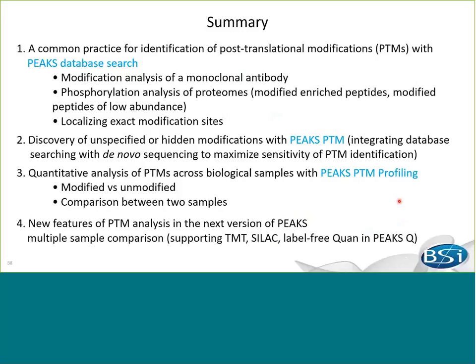So to summarize, today I have shown you the common practice for identification of PTMs with PEAKS database search. And secondly, how to use PEAKS PTM function to discover unspecified and hidden modifications. And also the quantitative analysis of PTMs across different samples by using PEAKS PTM profiling function.